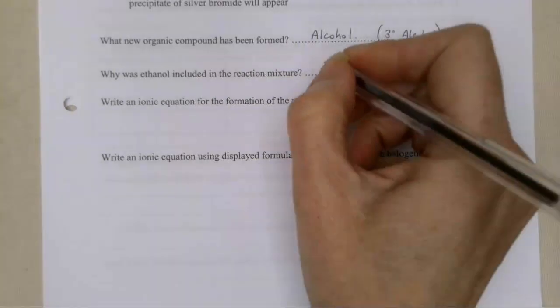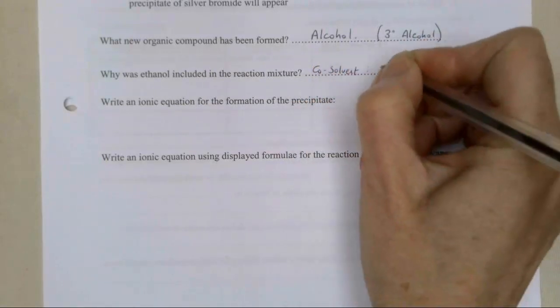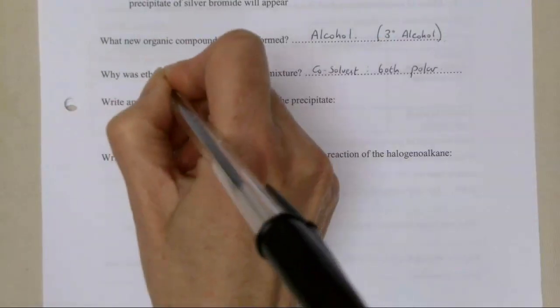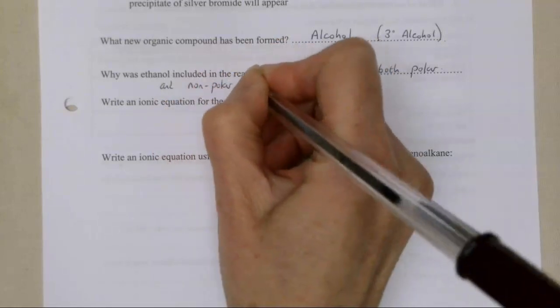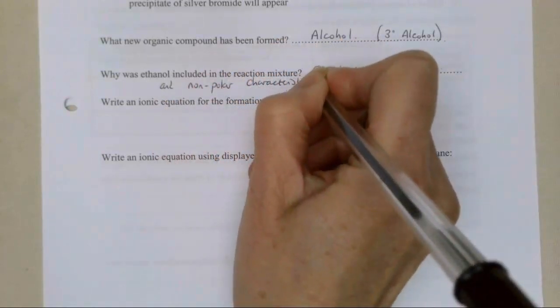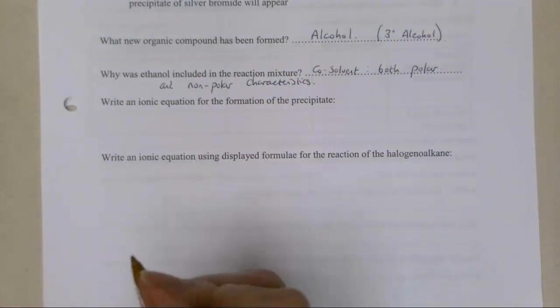Ethanol was added, if you remember, as a co-solvent. It has both polar and non-polar characteristics. So it can take both the potassium hydroxide and the halogenoalkane into solution.